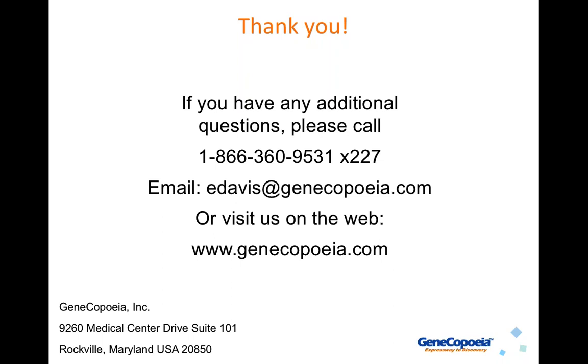Okay, next question. Do you recommend using ganciclovir to get rid of random integration? That's a good question. If you're really concerned about random integration, then yes, you might want to use ganciclovir. Some of our donor clones have the thymidine kinase gene on it, but it's usually not necessary. If everything is working well, then CRISPR causes a very large stimulation in the rate of homologous recombination.